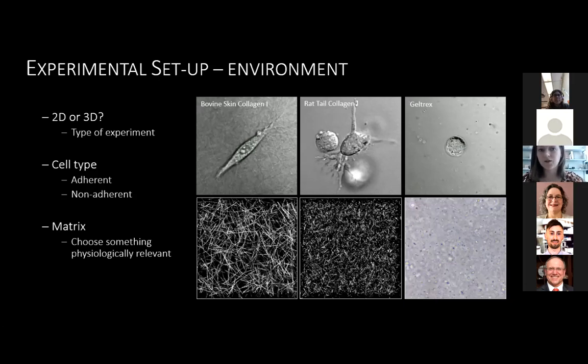So the best thing that you could do is to embed them in a gel. And you can embed them in a biological gel, or you can embed them in something that is biologically inert, like a polysaccharide gel. But whatever you choose, it's very important that what you're choosing is something that's physiologically relevant.